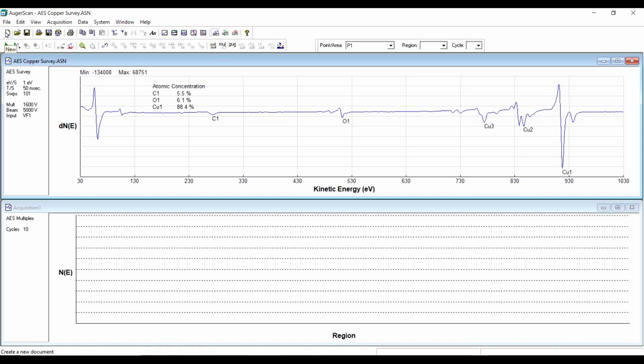If you hover over an icon, it should say what it is. So that's new survey or new acquisition, open an existing one, save, import, export. I think that's print. Yeah, this is print. Oh, that's export. That's export all. Print. This is copy. This copy is text. Paste.